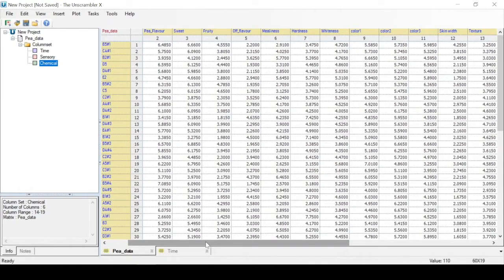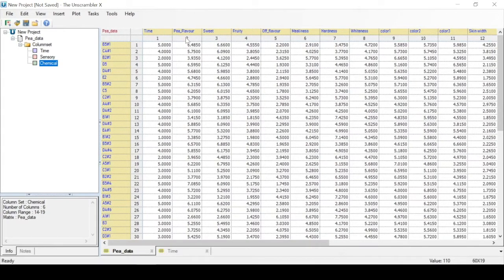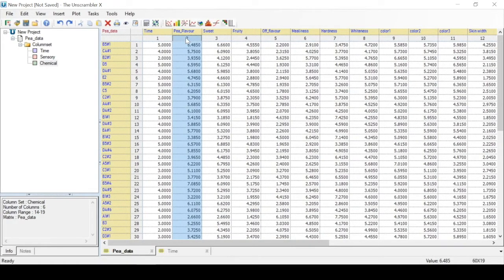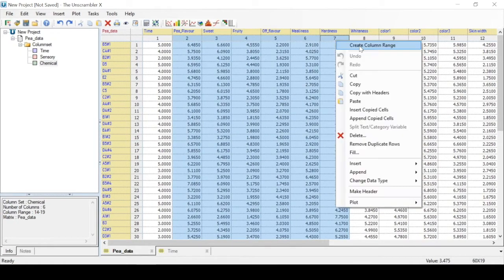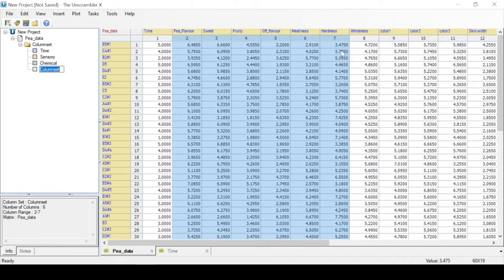Within our sensory measurements, it has been predefined that the first six variables are most important. So we can select the first six columns from pea flavor to hardness. With this selection, we can create a new column range called important sensory.